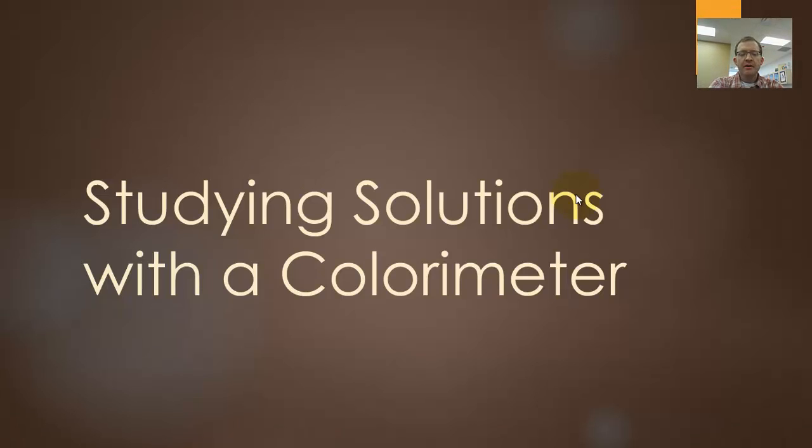In this video, we want to tell you about how we use colorimetry to study the concentration of solutions, or to determine the concentration of unknown solutions. So colorimetry is probably what it sounds like. It's basically using a measurement, that's the metry part, to study the color of a solution. And by studying the color of a solution, we can figure out how much of a certain solute is in it, and we can estimate or calculate very specifically the molarity of the concentration, moles per liter, of a solute in a solution.